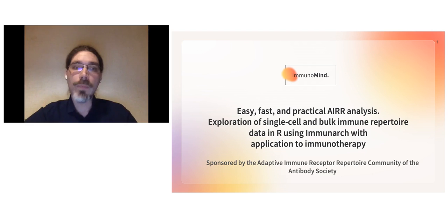This webinar was made with two goals in mind. First, I would like to give an introduction to Immunarch and a quick start to help you start using it now. And second, I would like to give a direction for further research to help apply immunogenomics to immunotherapy with some plan in mind. I provide interesting publications along the way, which will be useful to start thinking about immunogenomics analysis as a tool in a clinical setting, rather than just a discovery or foundational research tool.